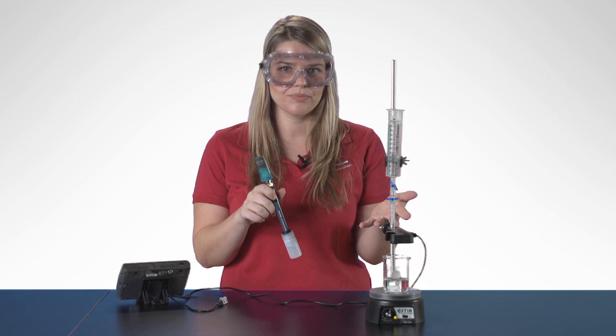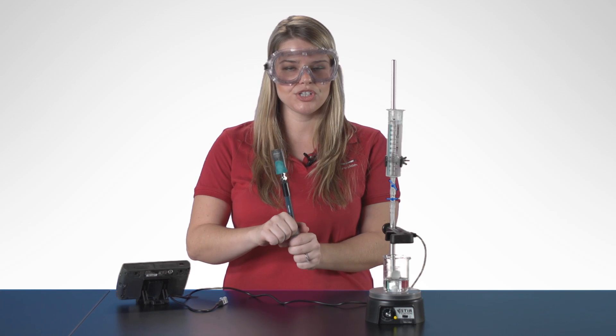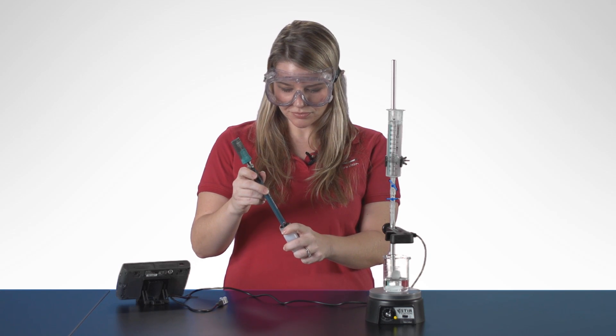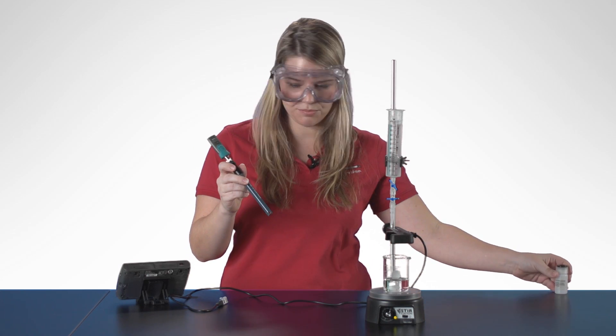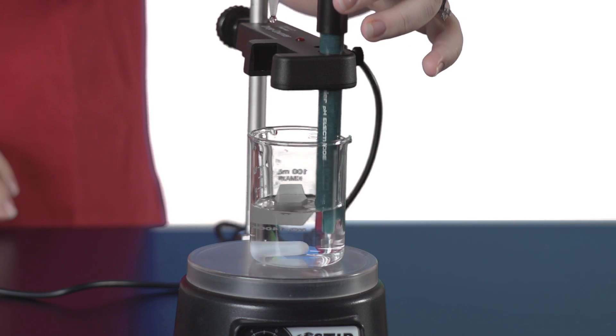Now we're ready to start our titration. I'm going to be demonstrating this titration with a drop counter. But if you're using a standard burette, you'll want to connect your Go Wireless PH and then set up events with entry mode. This will allow you to enter individual volumes as you dispense them into the beaker. I want to make sure that I remove my PH electrode from its storage solution and slide it into the slot on the drop counter.